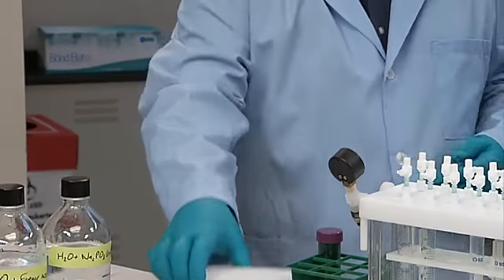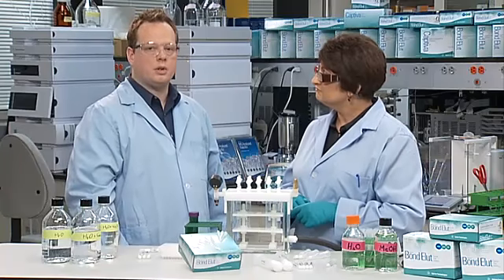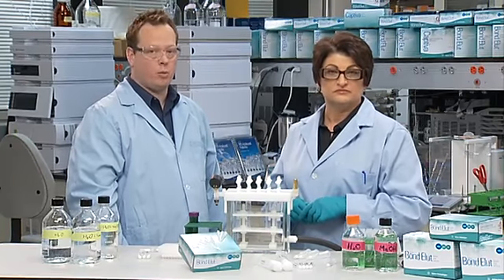For very small volume samples, the pipette tip format is a good choice, offering a vacuum-free process and shortened processing time. For large volume samples like water that require a large sample volume passing through the cartridge, choose a larger bed mass and larger volume capacity format.